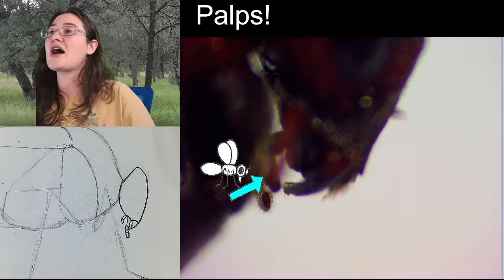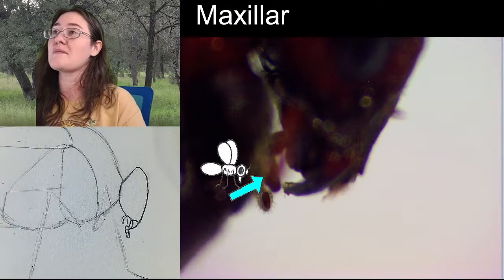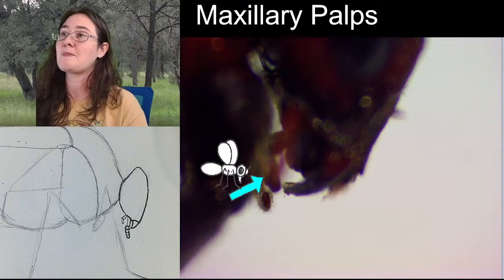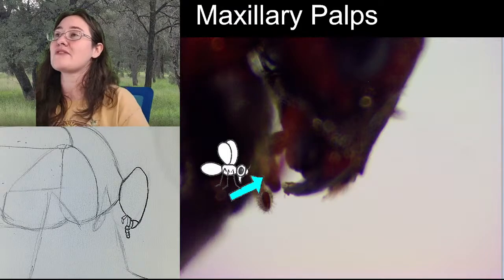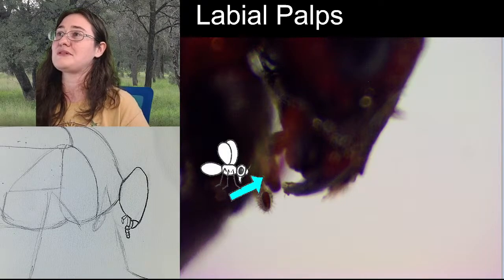So, we can now give them names. Those longer ones are maxillary palps. And then the short ones on the bottom, those ones are labial palps.